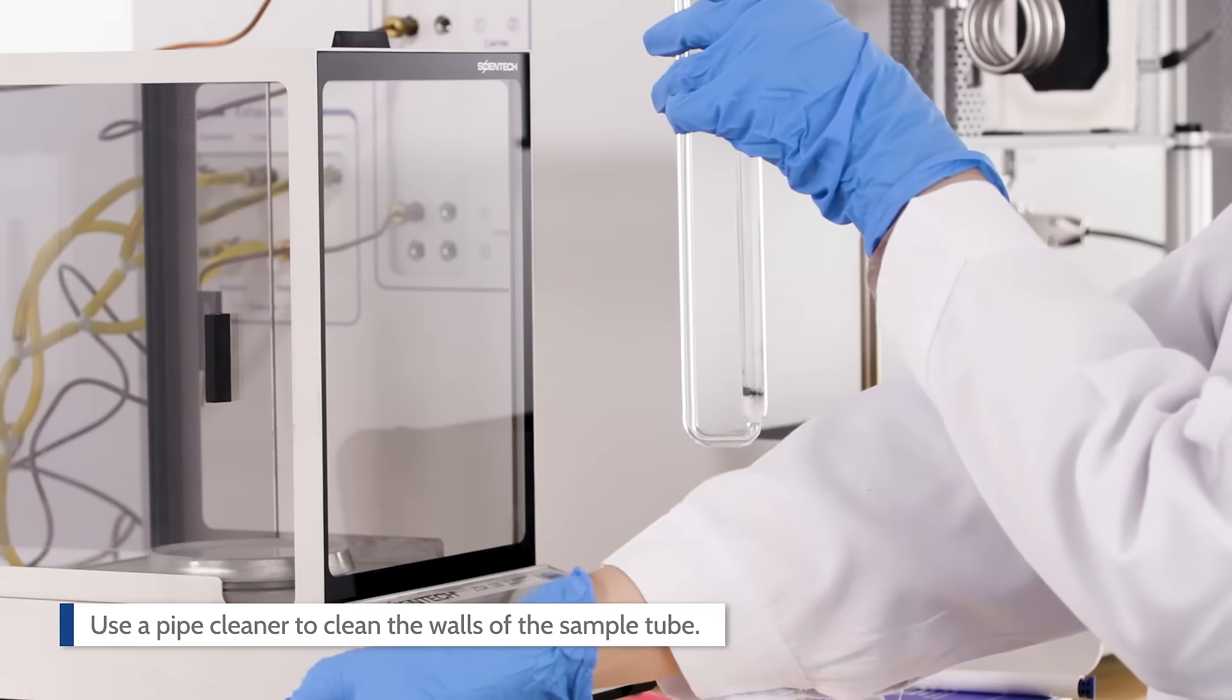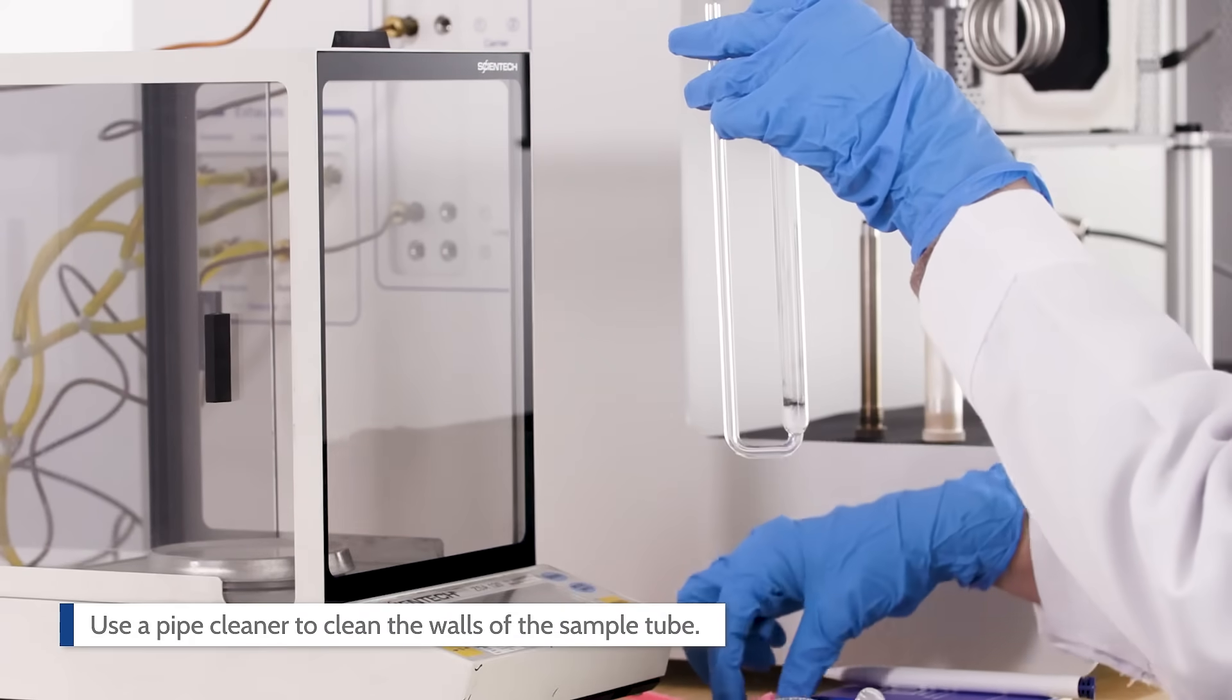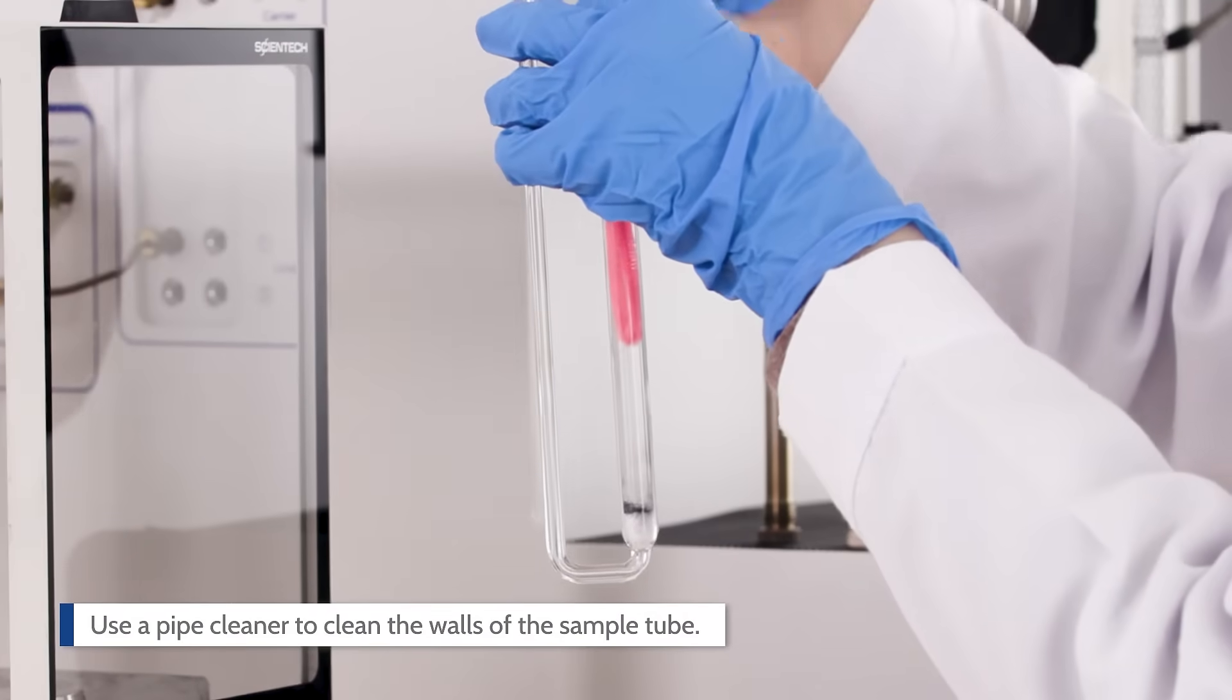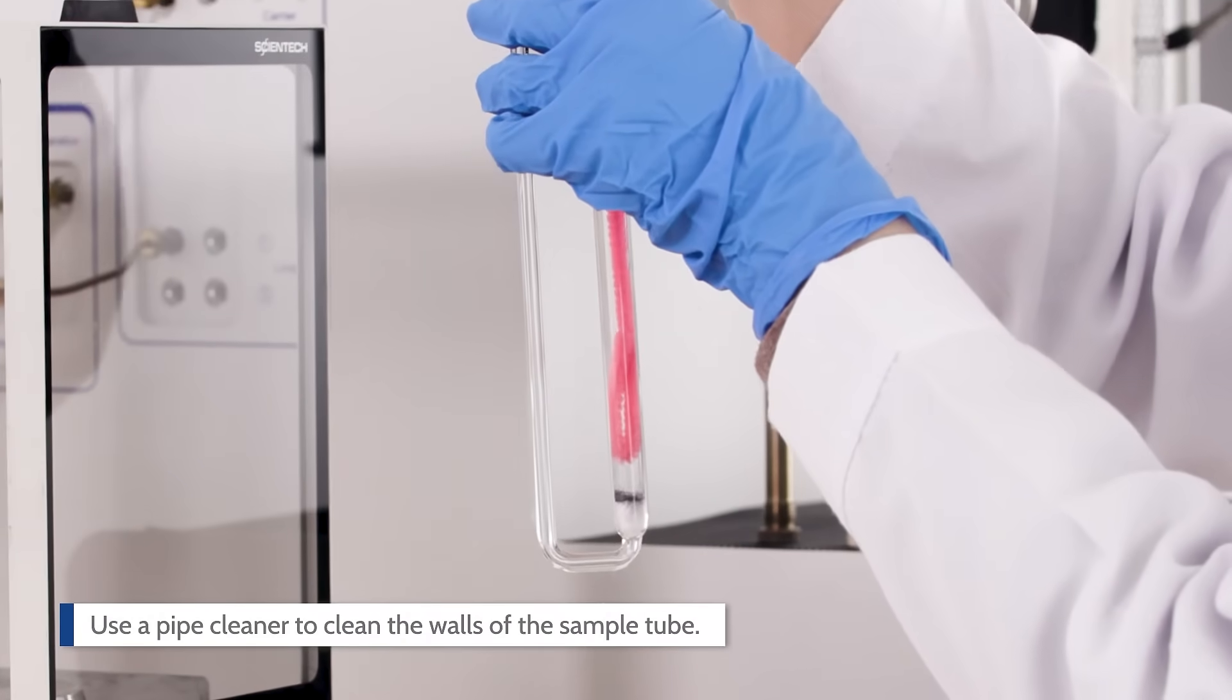Use a pipe cleaner to clean the walls of the sample tube. Make sure the sample bed is within the hot zone which extends to about 2.5 centimeters from the bottom of the tube.